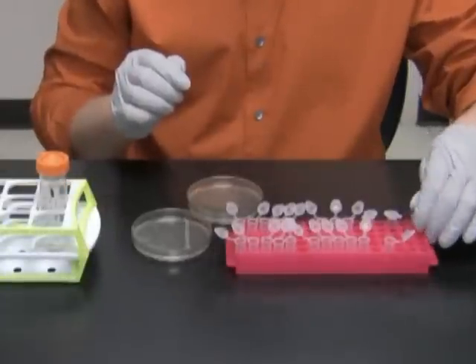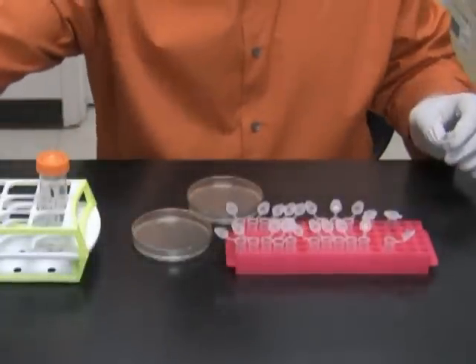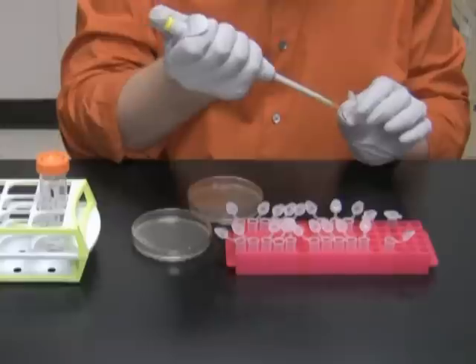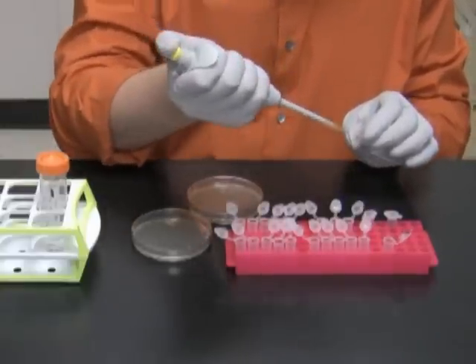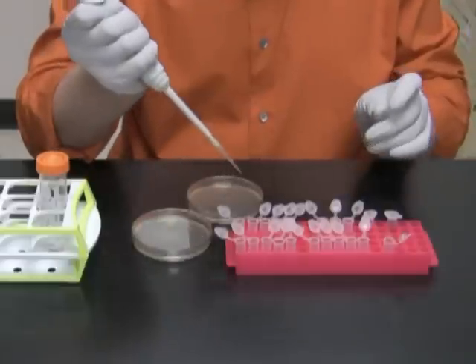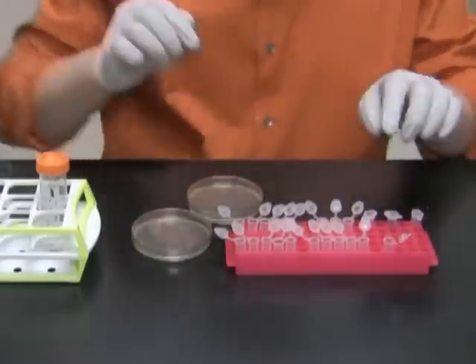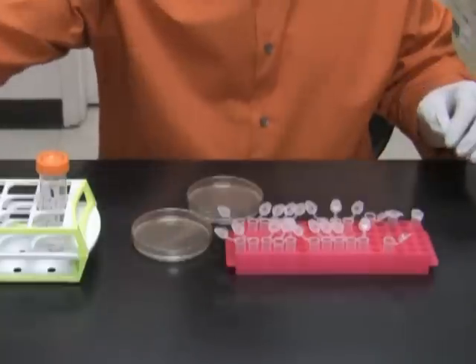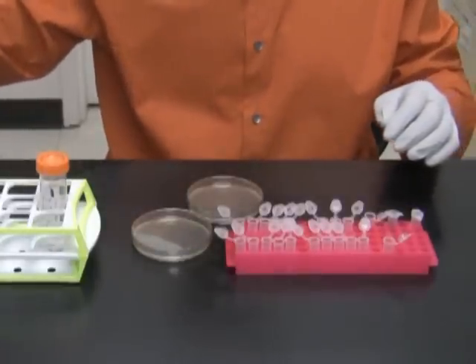Let's move on to the Cracking Gel protocol itself. I start by adding to each of the tubes 20 microliters of water. In tube 1, which will serve as a control, I will put 1 microliter of parental plasmid PSAT6 MCS.